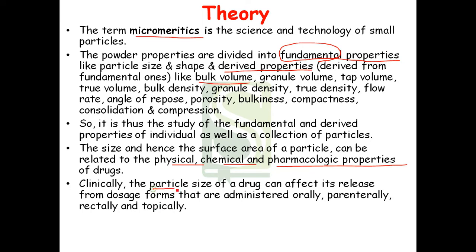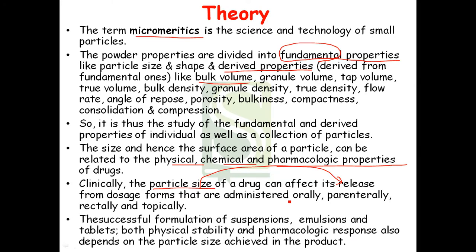So the particle size of the drug is very important because it affects the release from the dosage form. The successful formulation of suspensions, emulsions, tablets, along with their physical stability and pharmacological responses, all depend on the particle size of the product.